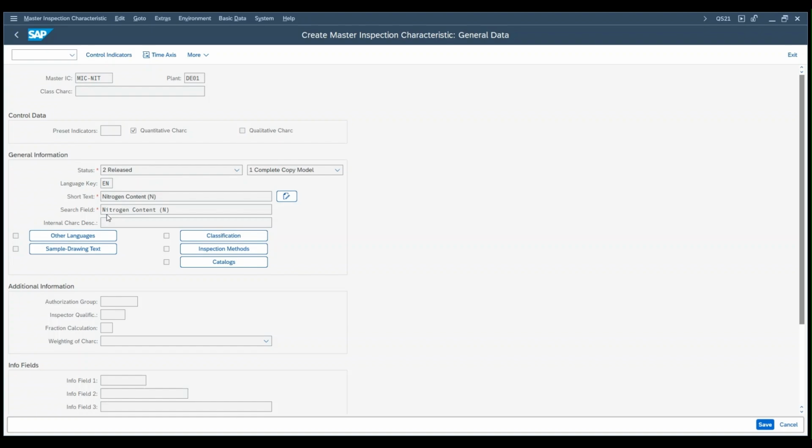We will require a sample procedure, and there's nothing else here. It's not extractive. It's a summary recording. We will check in other videos for functionalities when we need to put single results and we have more than one sample, for example. In this case, we will put just summary recording in general, and the characteristic will be required. It's not optional, it's not depending on the event. Okay, it's required. And what else? No, nothing else here.